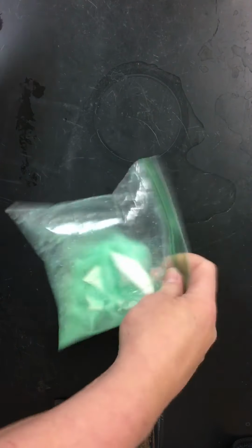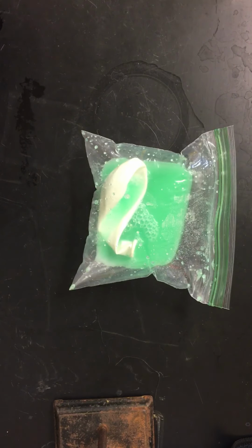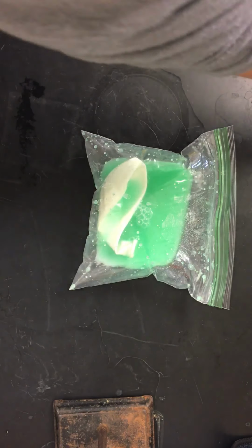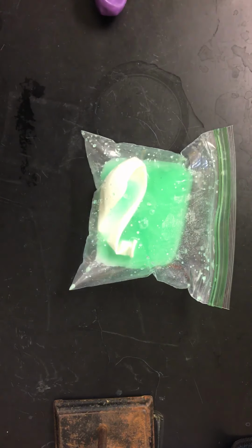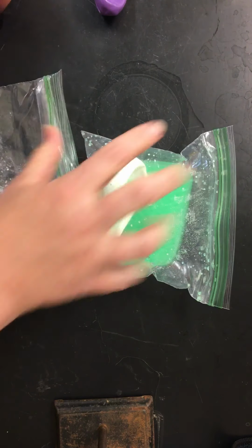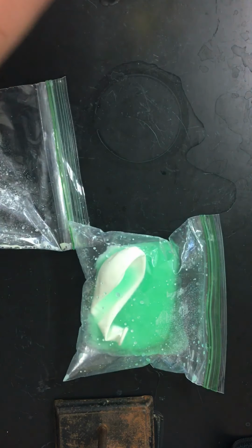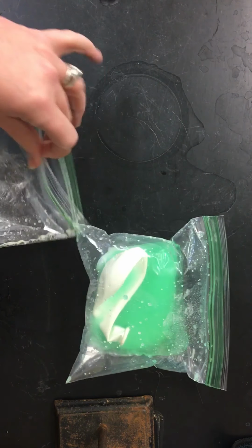So what if I did a bigger quantity? If I use more reactant, even though it's less molarity, it worked really well to create a larger reaction. But what if I use more of the stronger reactant like I did the first time? Well, let's see what happens. Remember, the second one was less concentrated, but I used a lot more of it. I'm going to repeat the first reaction using the same volume that I did for the second one, but of a stronger concentration. And then let's see what happens to the bag.